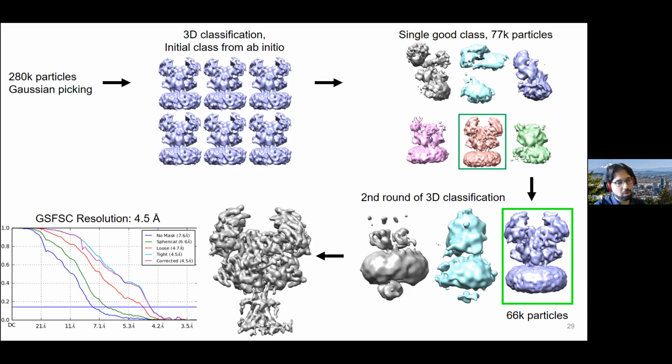I feel like those are the things that help you get from like 2.2 angstrom to like 1.8 angstrom in resolution. And so far, even at around 3.1 angstrom, we haven't seen an improvement from those. One thing that really helps us is per particle CTF estimation, and that's both CTF and astigmatism and everything. That usually gives us a pretty big boost. But particle polishing or beam tilt refinement at these resolutions, we haven't seen an improvement.